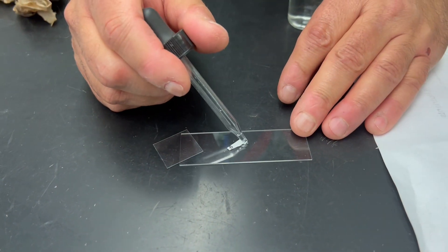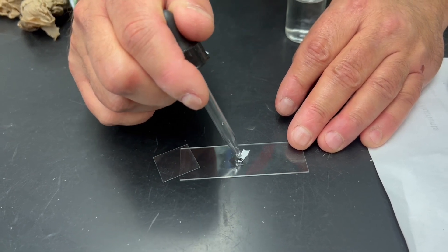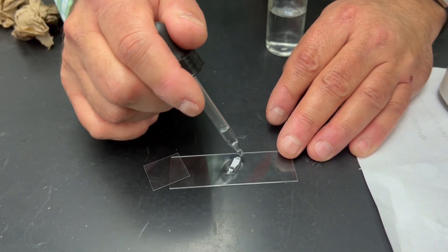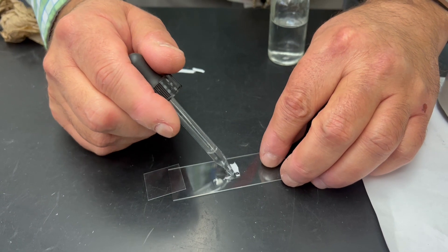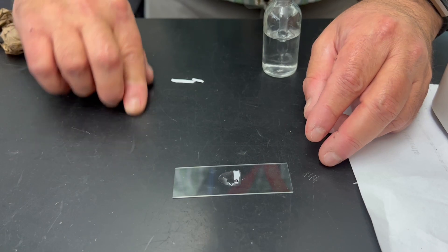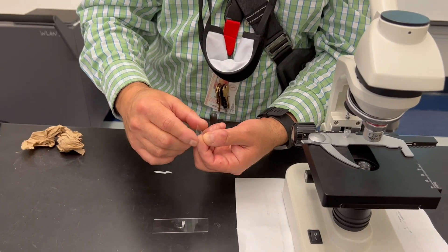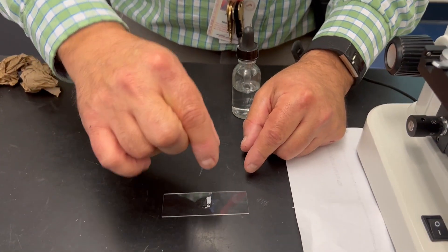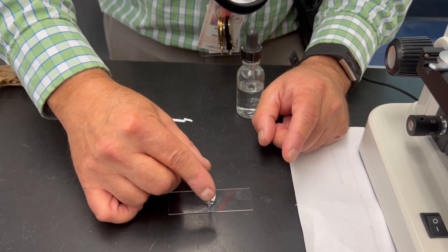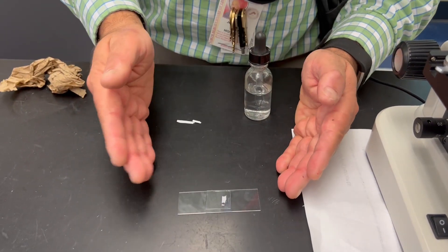I'm going to straighten it out and I want to see the E facing me. I'm going to add another drop or two of water on top of it. The letter E should be facing me. Then I'm going to take the cover slip and place it at a 45-degree angle — hold it on the sides — and drop it down like this. The reason I do that is to allow it not to have a lot of bubbles.